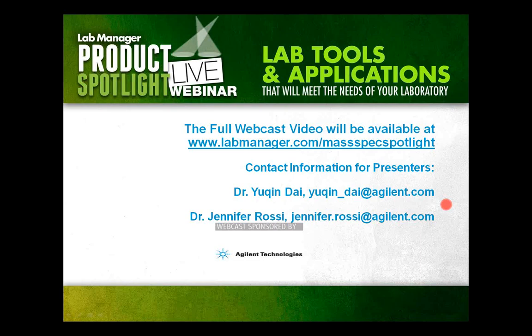And now, just to clarify, the RapidFire can only be used with other Agilent mass specs, correct? They can't be tied in with mass specs from other companies. We do have an integration with some additional mass spectrometers, namely SciEx triple quadrupole mass spectrometers. We can also interact with those. It's a simple contact closure for anything else.